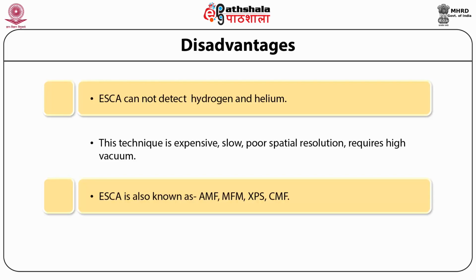We'll find out what elements are there at the surface. If the percentage remains the same, that means the layer had very uniform concentration of various metals or elements on the surface.